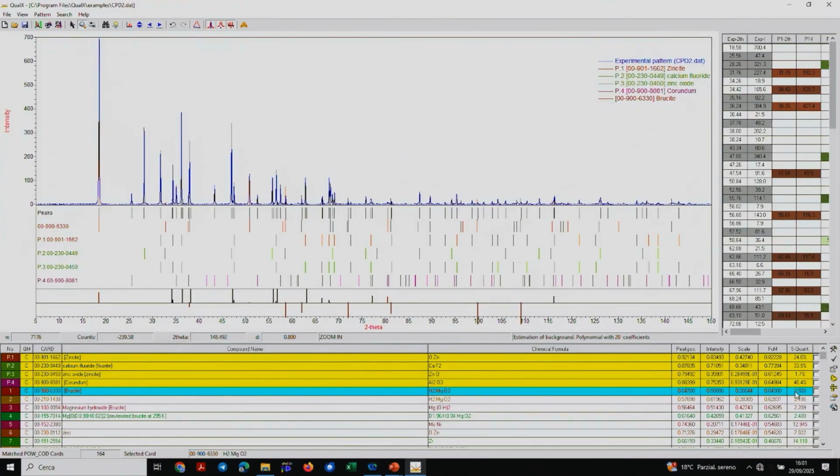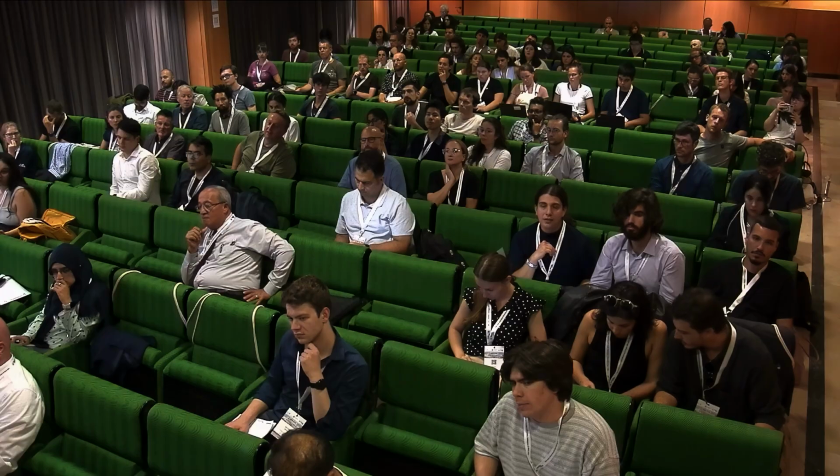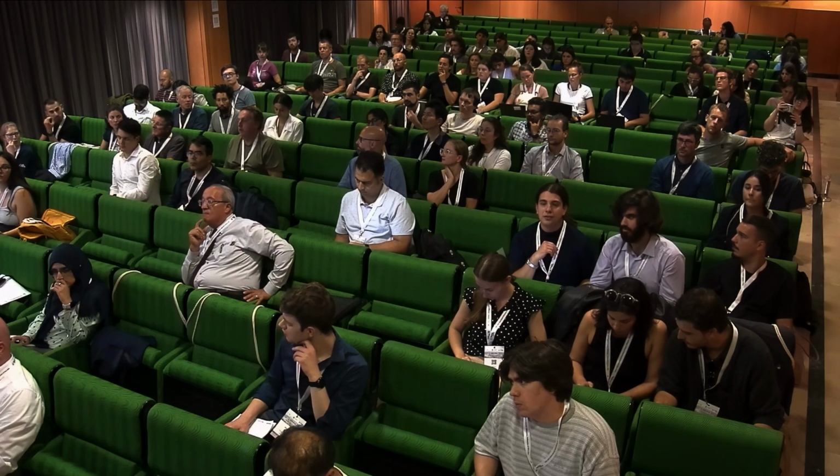Sorry, I can't hear you very well. The semi-quantitative analysis, the volume or weight percent? Weight percent. Weight. Yeah. Any other questions for this example?